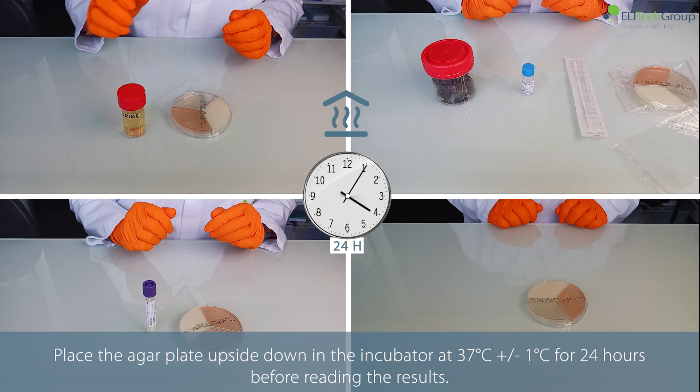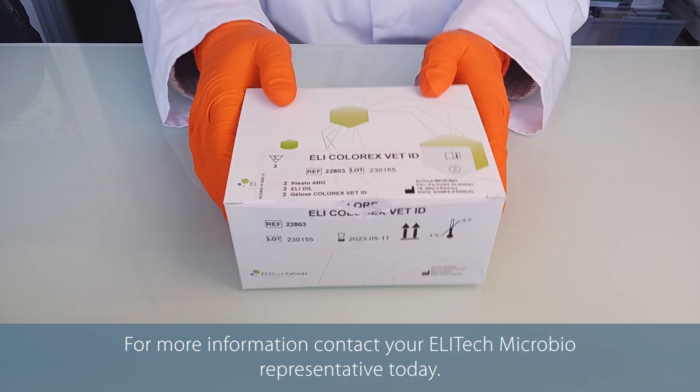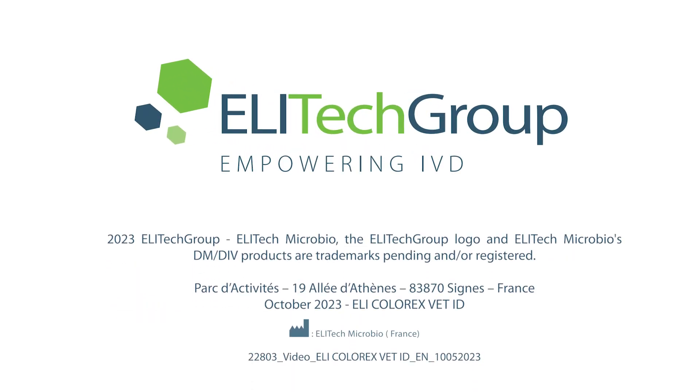Place the agar plate upside down in the incubator at 37 degrees Celsius for 24 hours before reading the results. For more information, contact your ELITECH Microbio representative today.